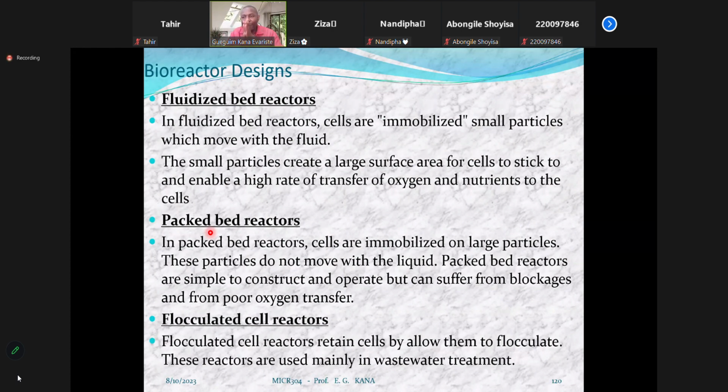Think a little bit of, what can I use to explain? Think of grains of rice in a pot of boiling water. Okay, that gives an idea of a fluidized reactor. In the boiling water pot, you have some grains of rice, and each grain of rice carries a large population of cells. That is, you have cells entrapped in those beads, in those grains. And everything is boiling, mixed, turning around inside the boiling pot of water. So that could be a little bit how the fluidized reactor looks when it's operational.